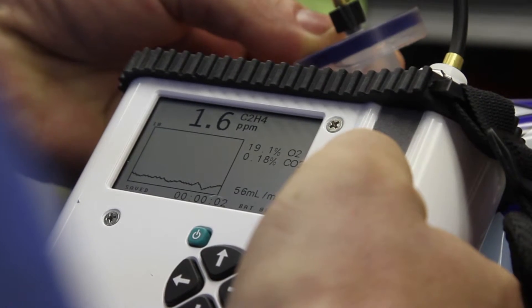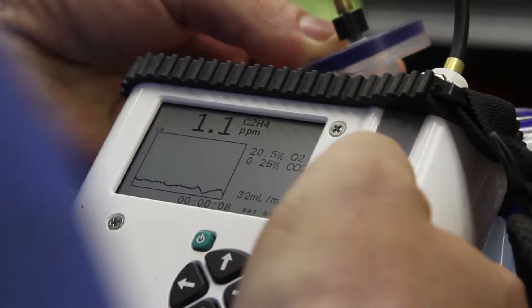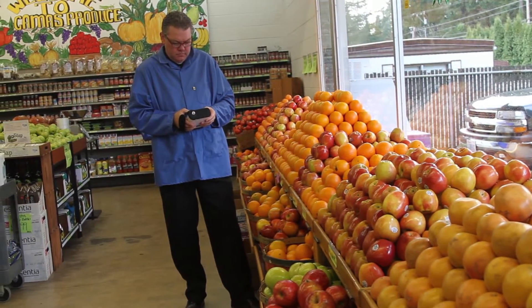Quality assurance for perishable cut produce demands a more comprehensive analysis. Most modified atmosphere packaging gas analyzers are equipped to only measure CO2 and or O2.